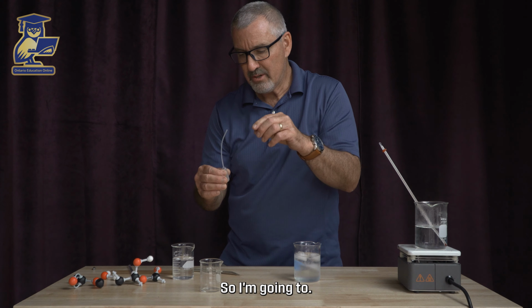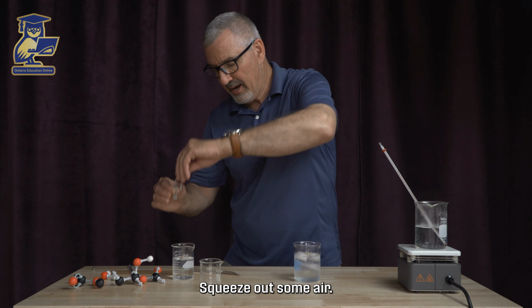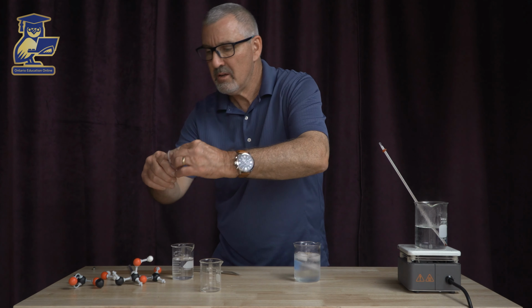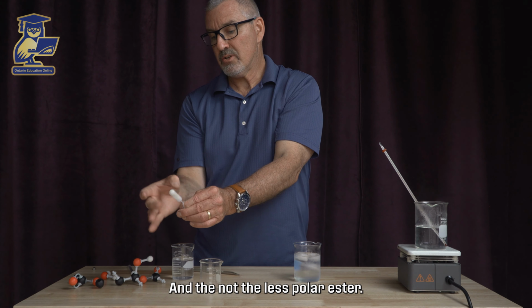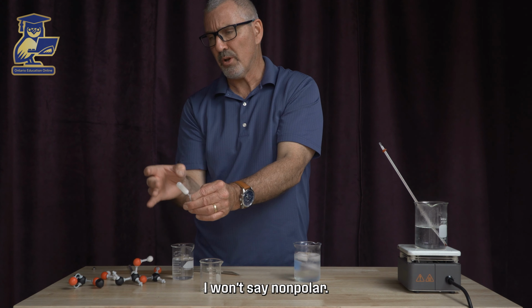So I'm going to squeeze out some air. I'm just going to introduce some water here. I'm going to mix that. It's like salad dressing. This is like water and the less polar ester. I won't say non-polar.